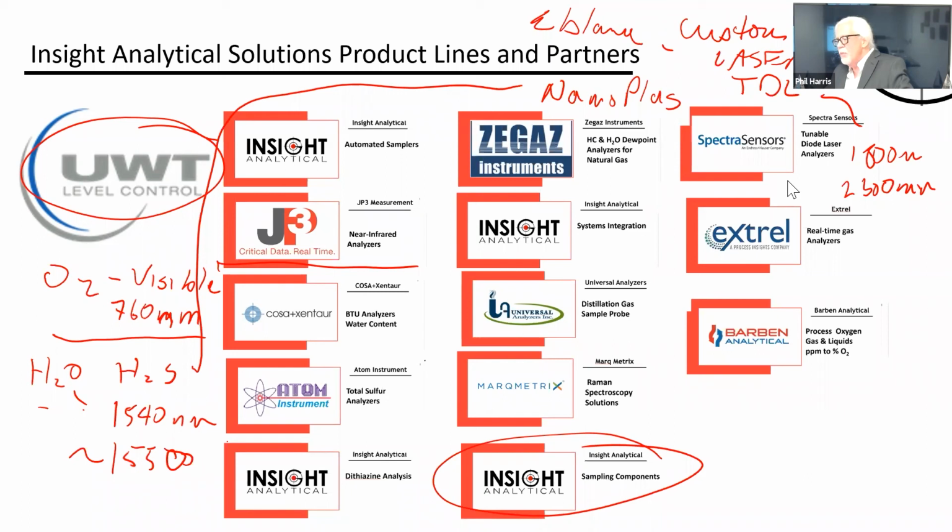Because as the lumiphore gets depleted, whether it's because of chemical attack or from seeing too much blue light, it doesn't fluoresce as much, and the amount of phase change you see changes. And so we get zero drift over time. If there's a lot of zero drift, it's usually a sign that the lumiphore is being attacked.